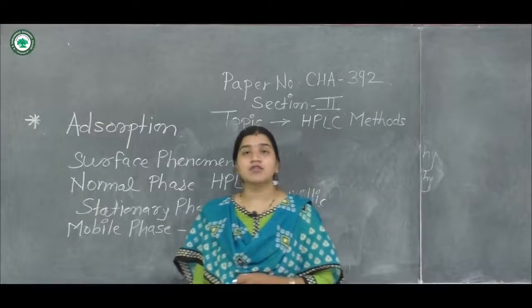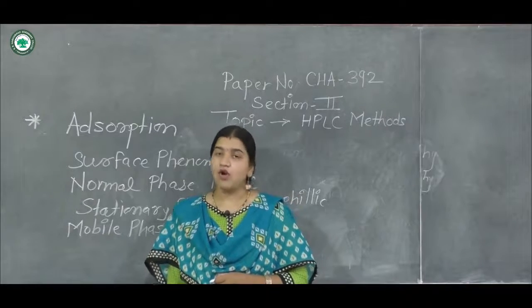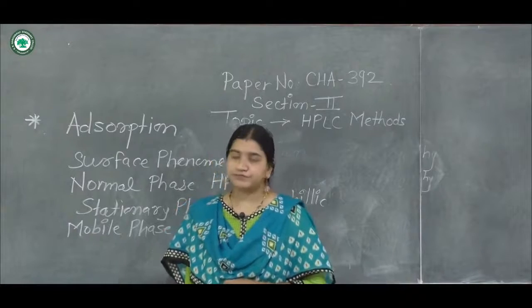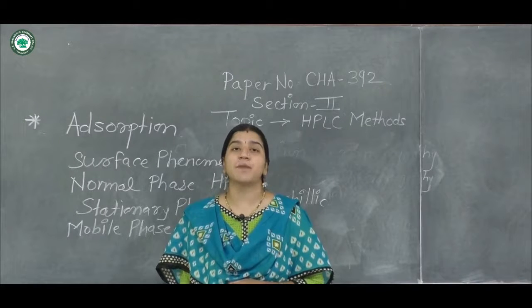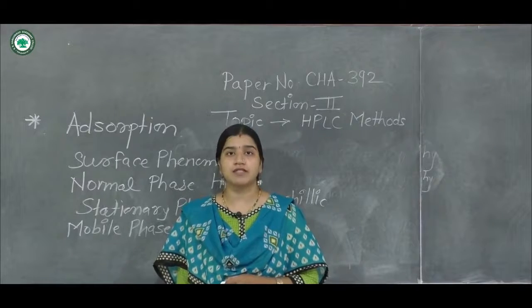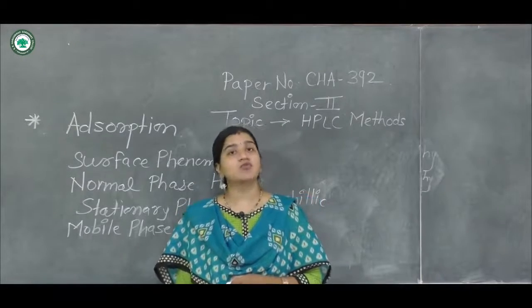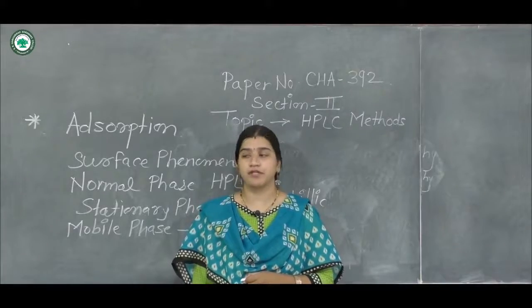Now coming to our original part, the discussion of adsorption. Now all of you know that adsorption chromatography works on the principle of adsorption. Here the separation of components from a mixture is carried out by using the principle of adsorption, and hence the name given is adsorption chromatography. So for that, what is the most necessary step? You have to consider the interaction between the adsorbate and the adsorbent.